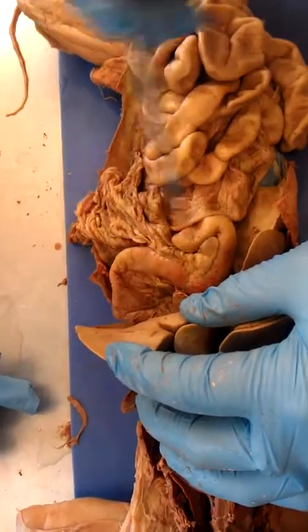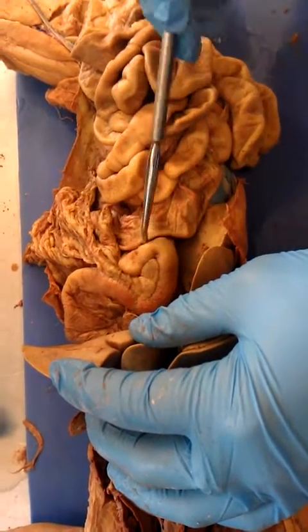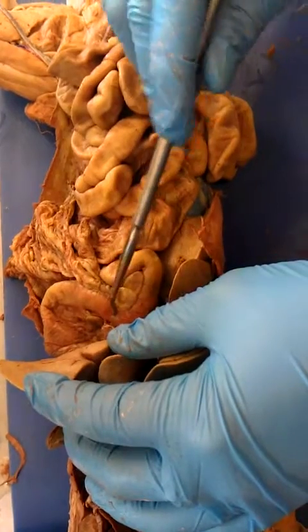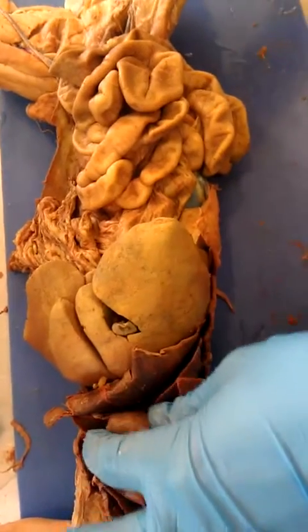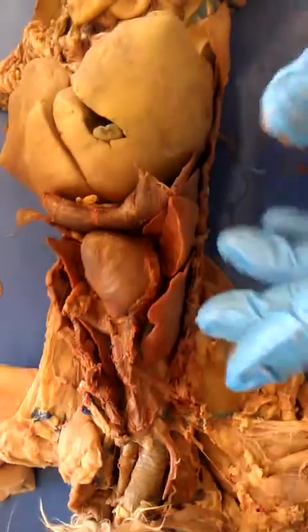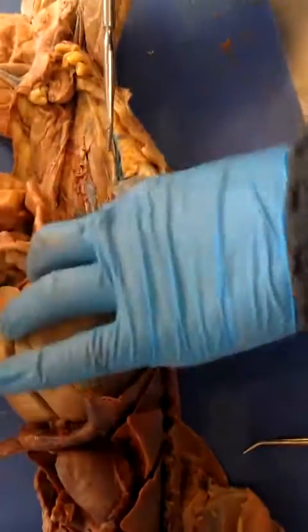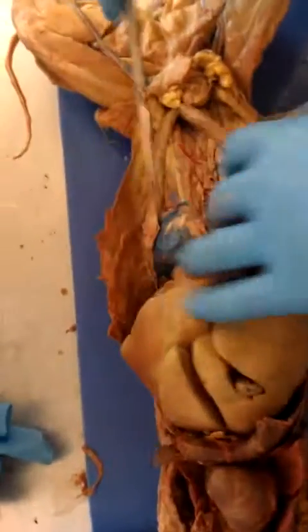If you were to cut the stomach open, the rugae are inside. This is the duodenum, this part right here. This is the pyloric sphincter. The heart, this is the right side of the heart, and this is the left side of the heart. Kidneys, they're blue on this cat. So it's this guy right here, and this one right here.